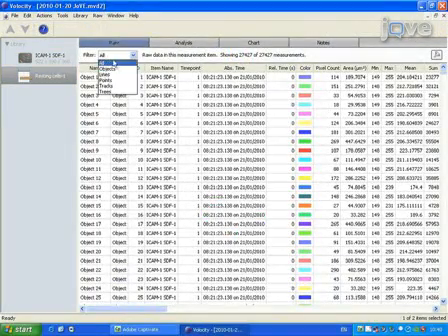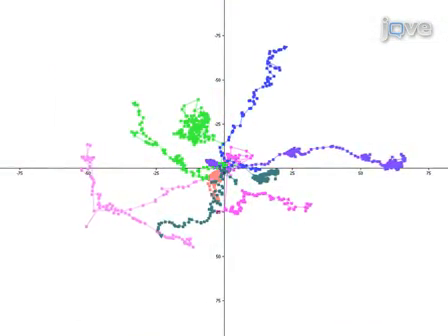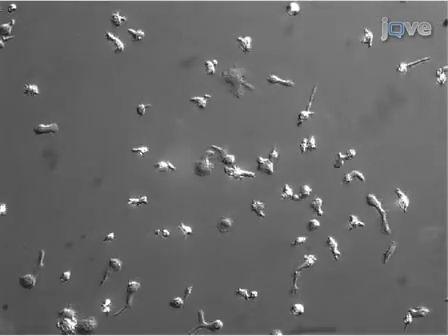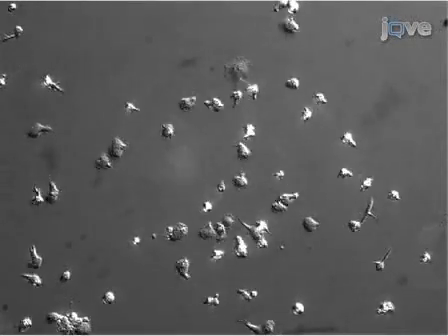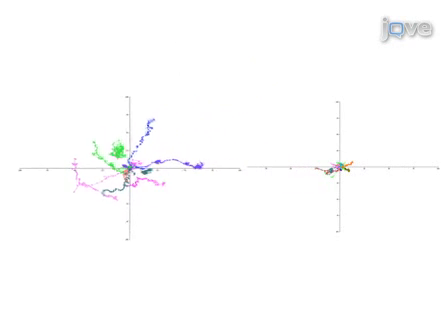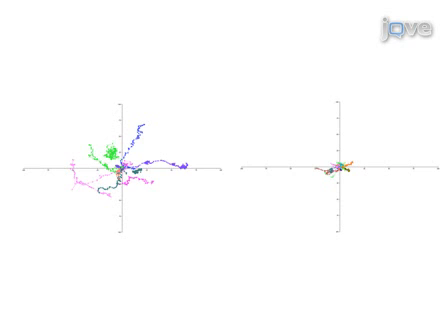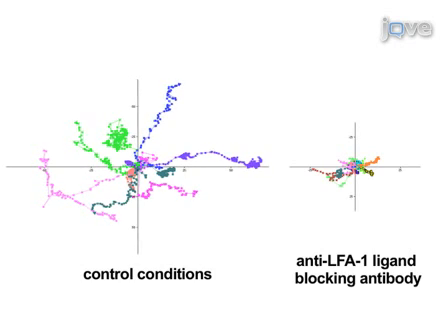To generate a spiderweb plot, collect the XY coordinates for each cell and time point, and project them onto a graph with a common starting point for each cell at the origin. The T-lymphocytes shown here were cultured, plated on ICAM and SDF1, and imaged every 10 seconds for 30 minutes. This movie shows the random migration of T-lymphocytes at a velocity of approximately 15 microns per minute. Using the XYT coordinates for each cell, 15 cells were chosen at random and plotted with a common starting point at the origin. Comparing spiderweb plots gives a quick visual depiction of differences in migration between different experimental conditions. Plots for T-lymphocyte migration under control conditions are shown on the left, while plots for migration in the presence of an anti-LFA1 ligand blocking antibody are shown on the right. These data demonstrate that T-lymphocytes utilize integrin LFA1 to migrate on an ICAM-1 substrate.